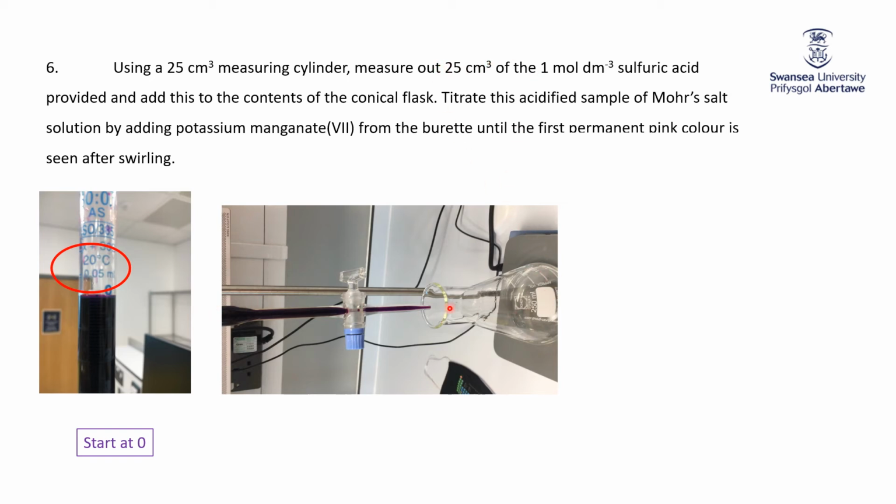There is my burette with the tip pointed at it. Now I'm going to press play here just so you can see what's happening, and because it will be clattering around just to provide realism of the stirrer bar, I'm going to add a little bit of the permanganate to the solution. The color will very, very quickly disappear as the permanganate reacts with the Fe2+, and I'm going to show you a couple of those type of additions.